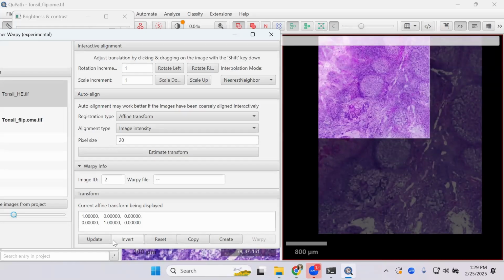Okay, no, seriously, it's 0.325 divided by 0.22, and that gives us a number of 1.476. And we're gonna replace the ones with 1.476. Four, seven, six. And that is it. And then what I need to do is I need to click update.